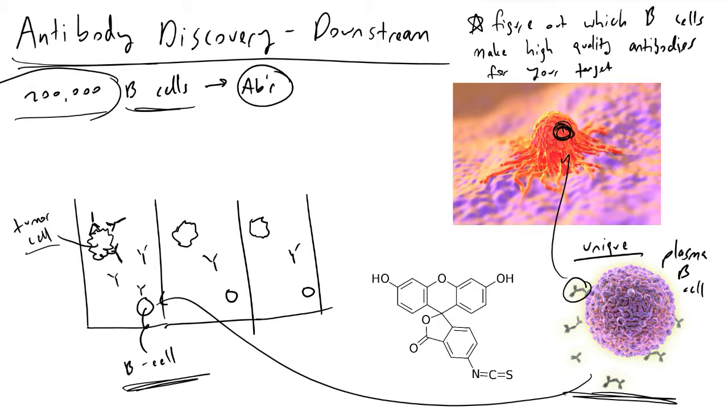And this is fantastic because if we're able to get antibodies to stick onto a tumor, it's very likely that your immune system can recognize that tumor, and once it's done that, it can effectively kill the cancer that's inside of you before it kills you. So this is a very good pen that we have here. And the unfortunate case is that most of the time, in these other two pens, there's really no affinity for the antibodies that these B cells make for that specific tumor.